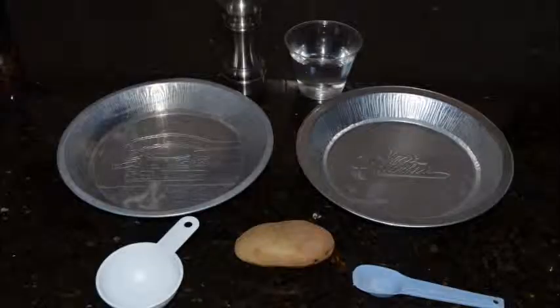We will now do an experiment with osmosis. This experiment will show osmosis as it relates to plant cells. Cell membranes allow water and oxygen to move freely, but no other molecules. This means they are selectively permeable or semi-permeable.